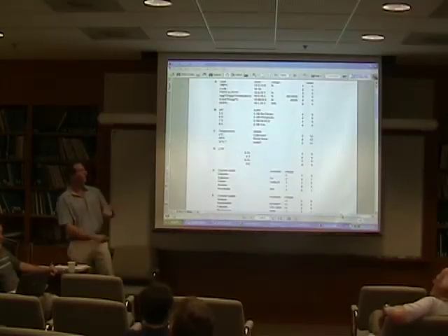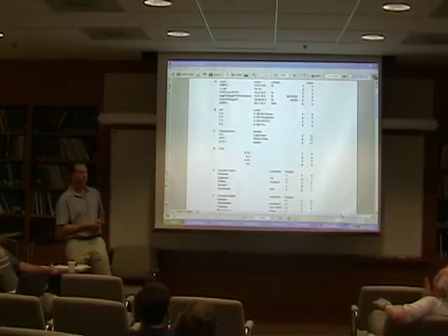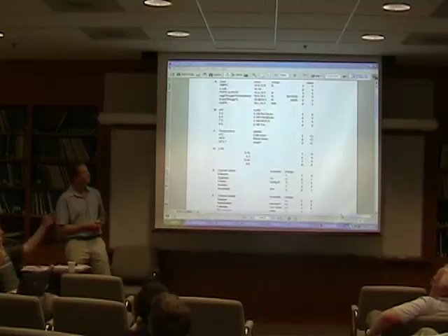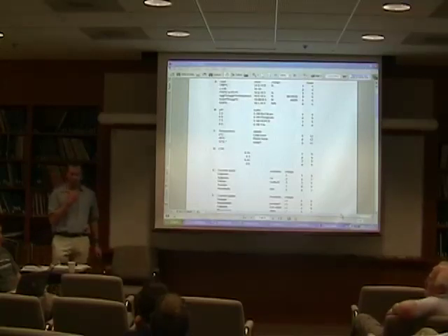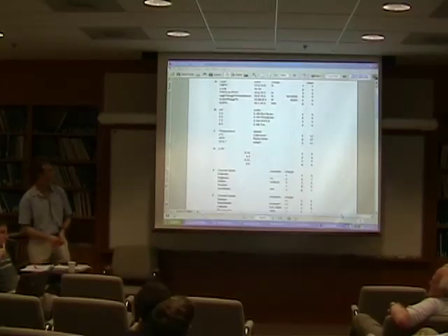So, Bob, before you mentioned that you thought you had certain favourite lipids, for example. Would you say that this is a good coverage of lipids? Is there any you would remove? I'm not familiar with brain lipids being a very productive one. There's a lot of PC there, and so it just samples different space, essentially. You can sit there and go PC, but then Tom gave the example today of the aquaporin that doesn't constitute PC at all. So I think it's important to have an alternative there. But just my opinion, if you left the brain one out, there'd still be plenty of variety there.